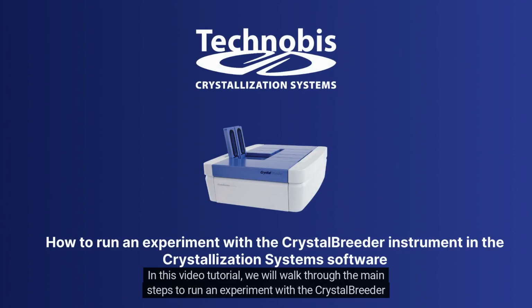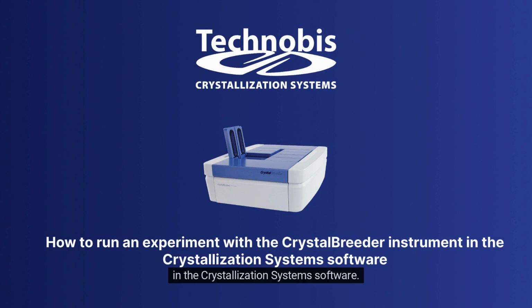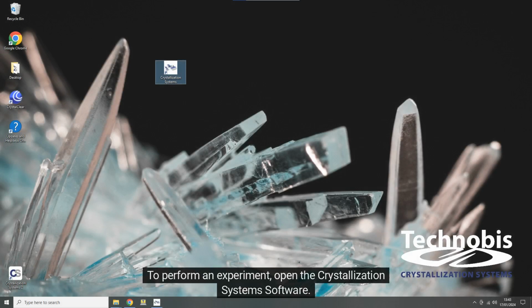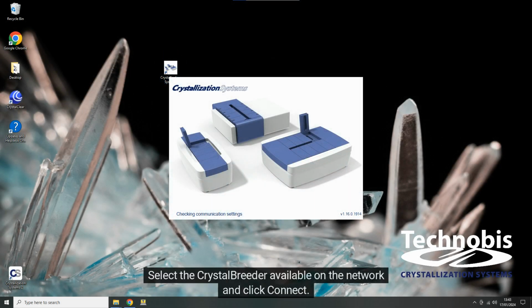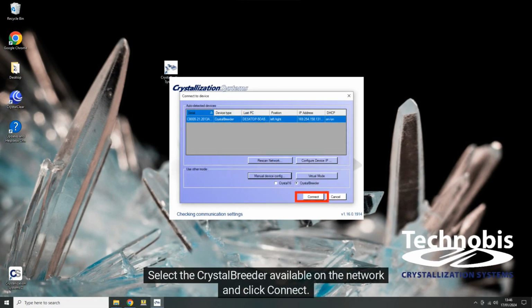In this video tutorial, we will walk through the main steps to run an experiment with the CrystalBreeder in the Crystallization Systems Software. To perform an experiment, open the Crystallization Systems Software.